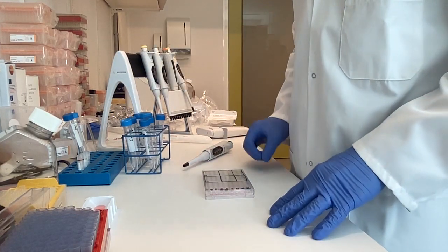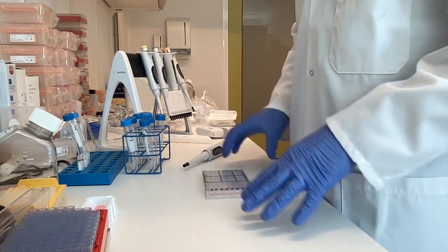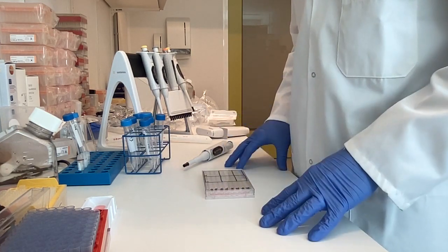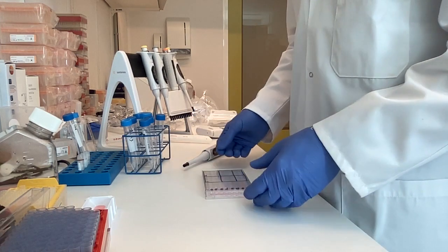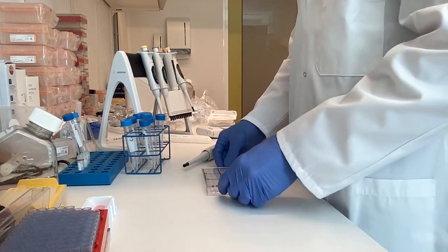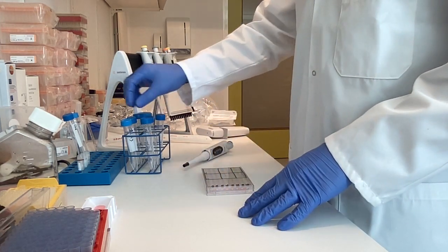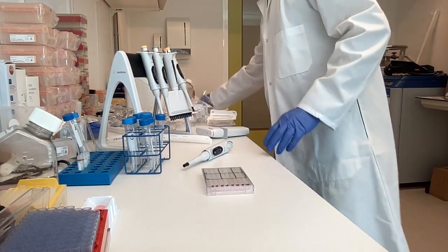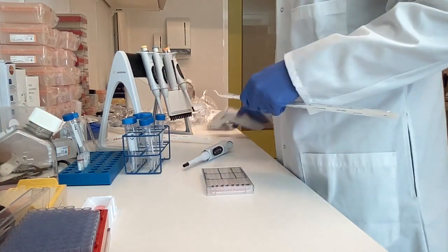So in this video we're doing the method A testing, and the plate has enough space to test two different products. That's why I'm showing you two different products here. And so first we're going to make the R3 solution.